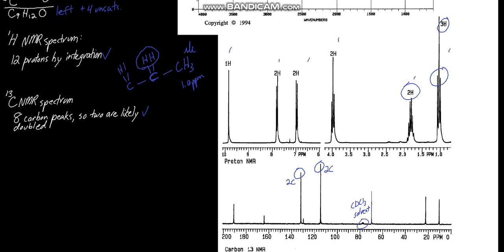That would require another CH2 here, and really everything here is CH2s, except for this 1 hydrogen we'll look at in a minute. So this would result in 6 lines, 1, 2, 3, 4, 5, 6, due to the number of neighboring hydrogens splitting this signal.